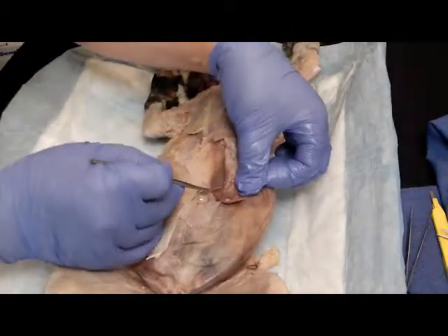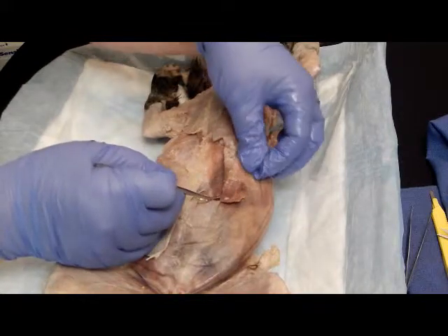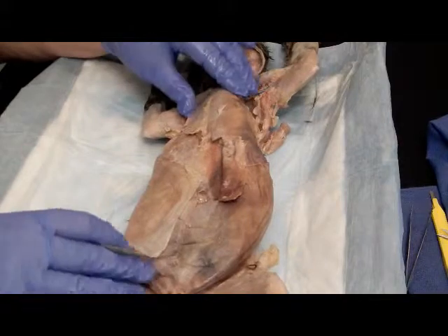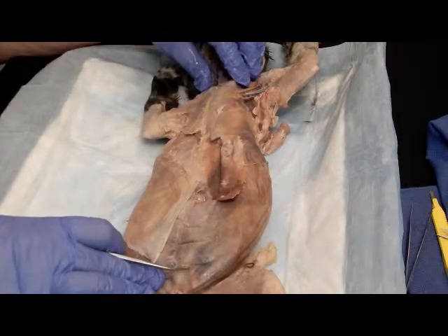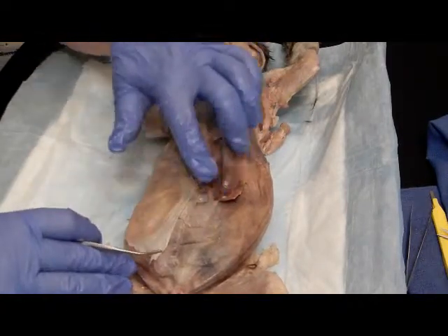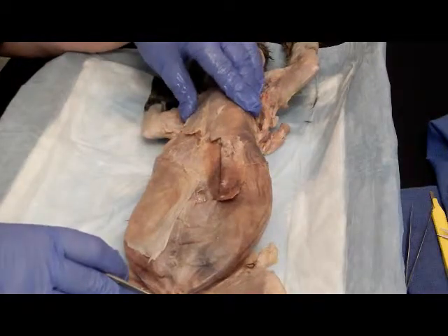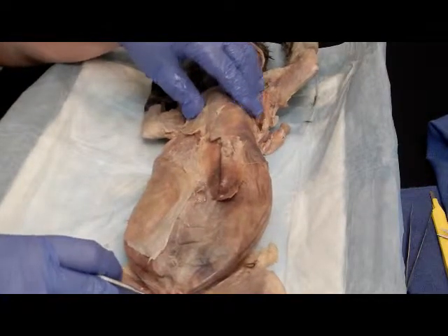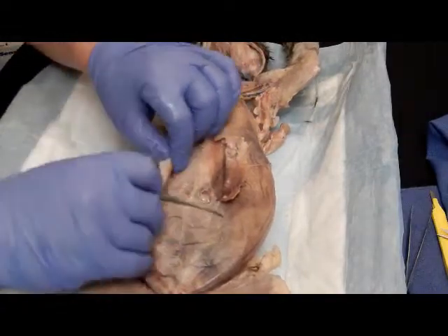The internal oblique, its origin is the lumbar fascia, iliac crest, and inguinal ligament. Its insertion is the linea alba, pubic crest, last 3 or 4 ribs, and the costal margin, and has the same function as the external oblique.